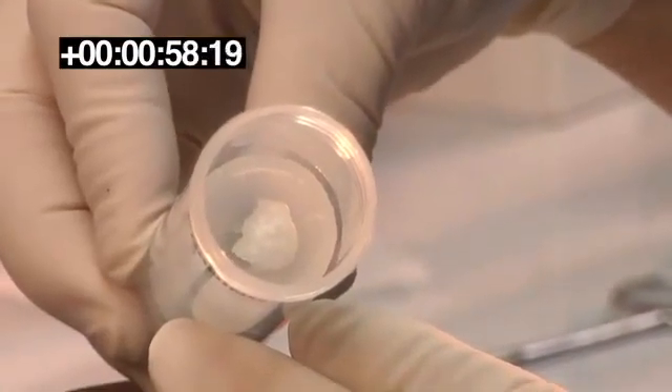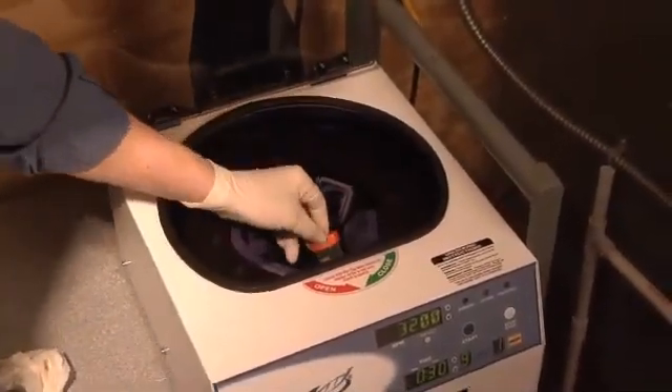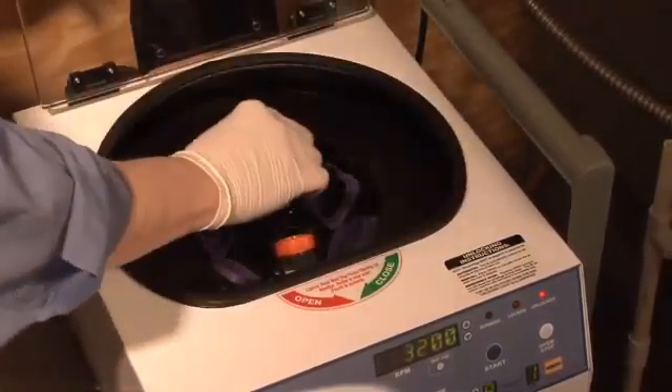Ready for the centrifuge. We're going to run this at 1800 G's for about 45 seconds to drive that pellet of tissue into the syringe barrel to improve the surface area to volume ratio, and then bring it back to the biosafety cabinet for retrieval.